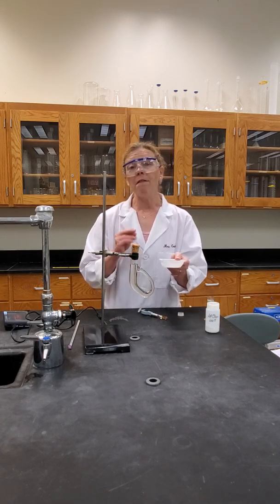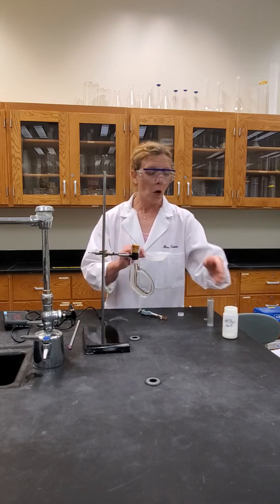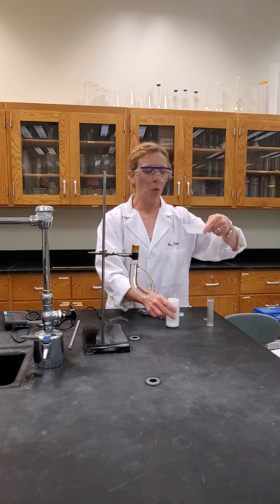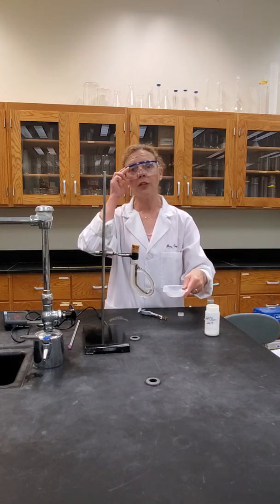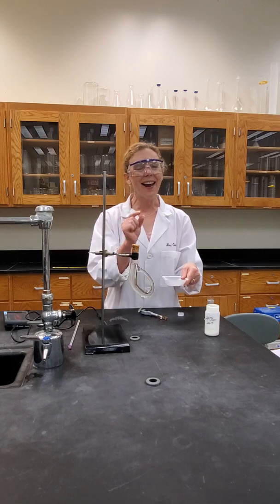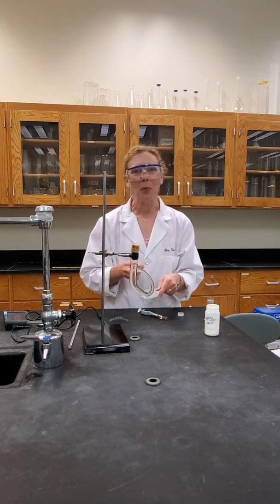You just need a very small amount of whatever compound you're testing. So if you get a weighing tray and then simply pour in a very small amount, or whatever your teacher directs you to do, you need probably half of a match head size. And you can always get more, we know that.